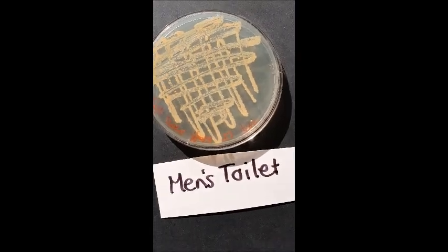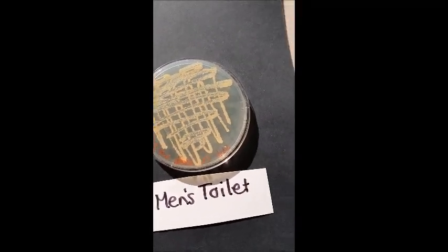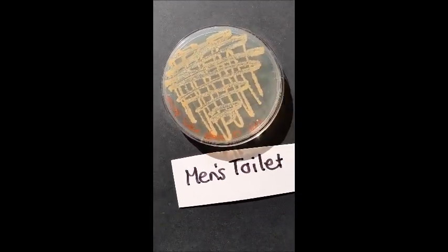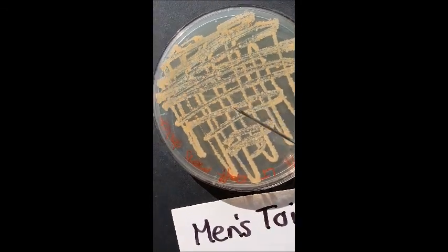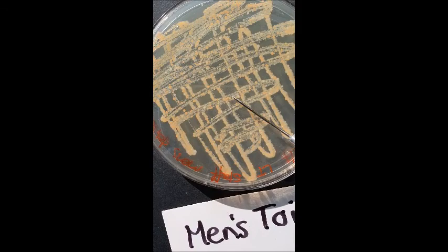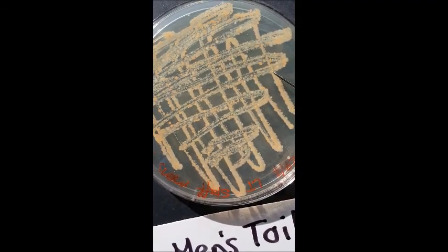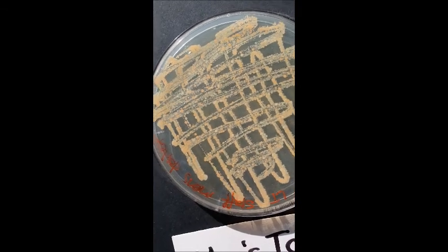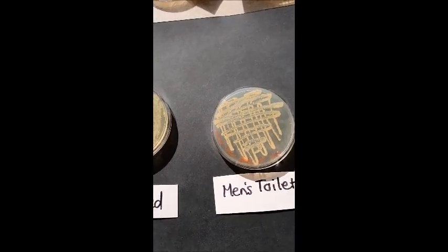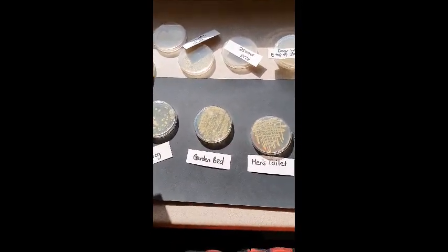And then this one. This is from the men's toilet. I actually got the swab and I shoved it kind of underneath the lip, like in the bowl, where the cleaning is really hard to get to. And I haven't seen this bacteria anywhere else. This is like some bright red crazy stuff that is obviously living in the toilet bowl. I'm not going to count them because, yeah, there's a lot. We'll just say many. So yeah, there's some comparisons for you of some places with high growth.